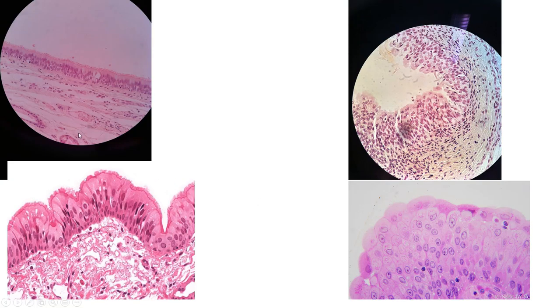So coming here, this is pseudostratified epithelium. So pseudostratified columnar epithelium. So it looks like multiple layers, but it's actually one layer of cells. And on the surface, you're going to have cilia. This is found in the respiratory tract. Same thing here. This is a good picture of it. You see the cilia on the surface. So found in the respiratory tract structures such as the trachea and other airways.